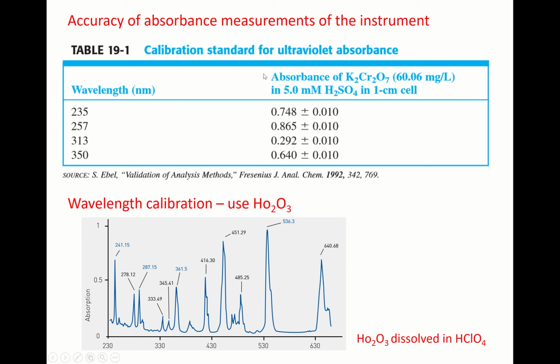This table can be a guide for calibration of absorbance. But holmium oxide is used for calibrating the wavelengths. That's the difference.